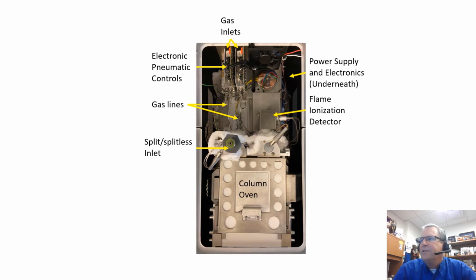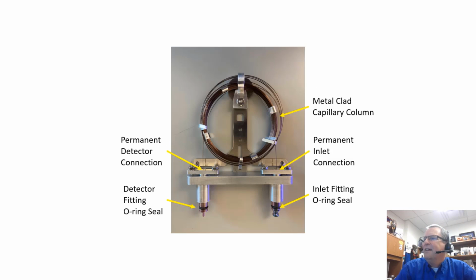One nice thing about this system, which I do like about some of the miniaturized system folks, really are thinking about also using traditional fittings. In fact, I took the top fitting off of an old Agilent GC, and I stuck it on this one because it seemed to behave better with some of my syringe needles. So that worked out very nicely. So a couple of other things.